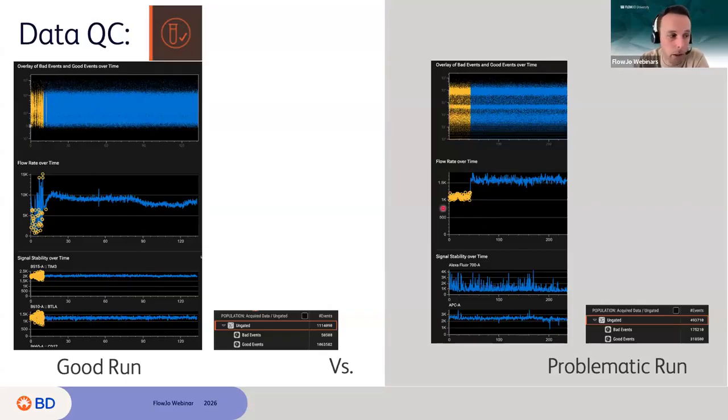So really here, maybe the user just wanted to run faster for whatever reason, maybe there was a user behind them just waiting to jump on the computer, on the instrument, and they were at the end of their time and wanted to make sure they ran the full sample, or maybe they thought 1,000 events was too slow. But anyway, they physically changed the speed, so it's normal that the flow rate increased.